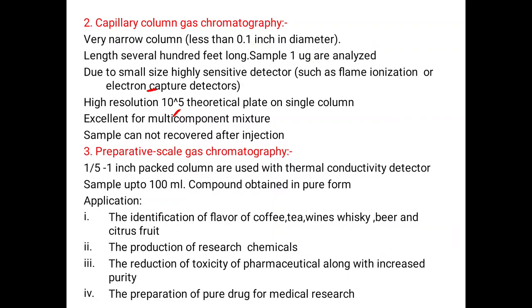Commercial operations based on preparative scale GC have been developed as a means of making large quantities of highly pure compounds, drugs, and other fine chemicals.